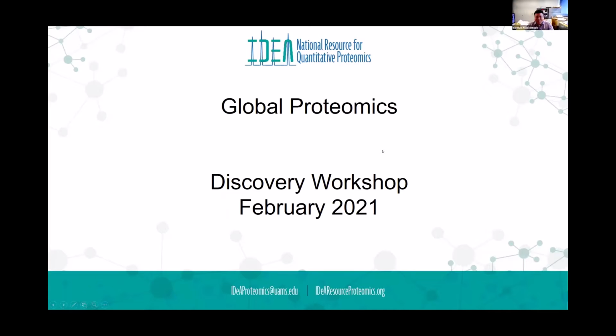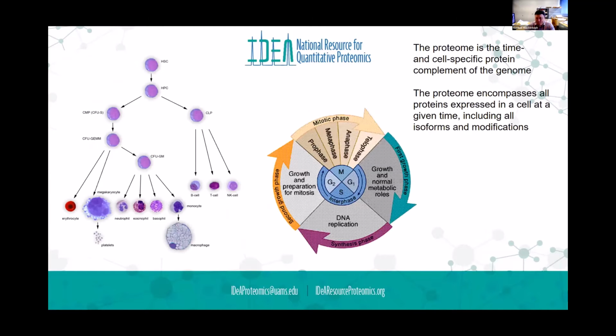All right. So we have today a slate of very dynamic and interesting speakers as opposed to just me and Rick. But before we get to that, I'm going to talk a little bit more broadly about global proteomics. We touched on this throughout the talks yesterday, because it's essentially what we do most of the time: look for patterns of changes in complex samples.